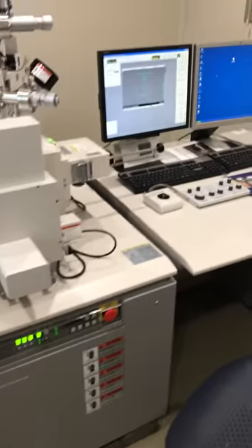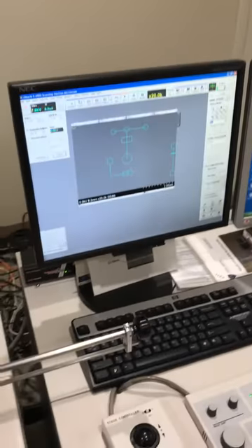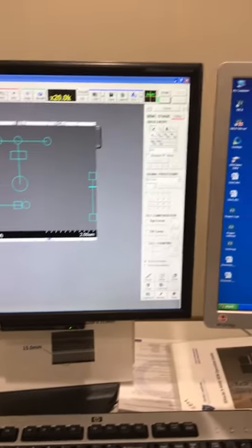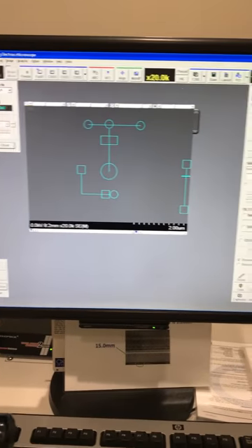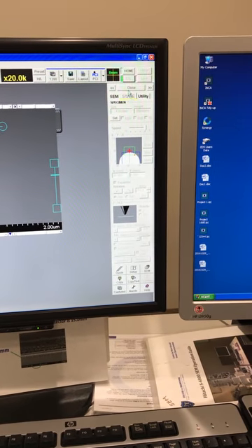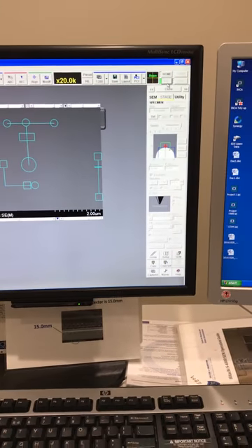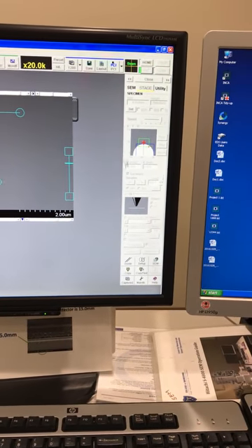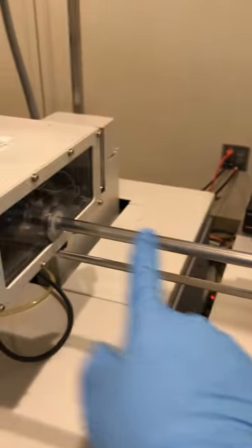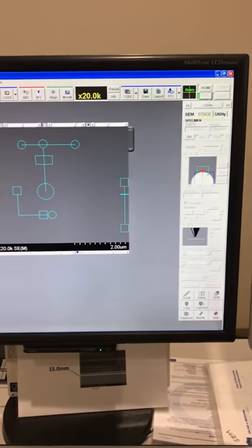Now you are ready to load the sample inside the microscope. Loading starts here on the SEM software, in the Stage tab. Make sure you are at the Exchange Position — this is the location the sample holder can reach via the rod. We are now at Exchange Position and the exchange light is solid green.